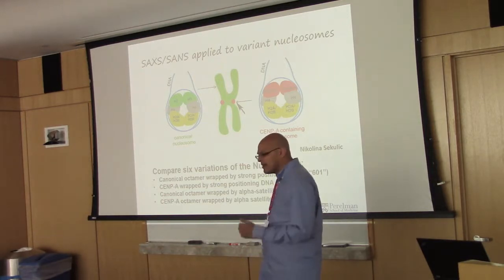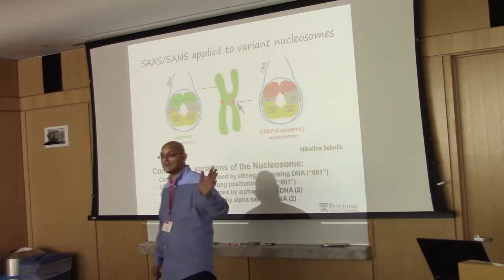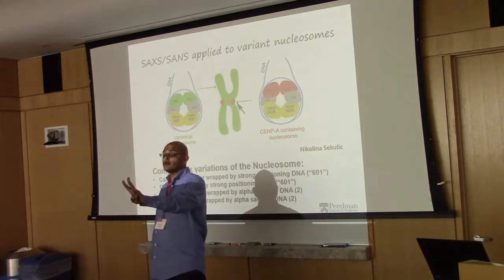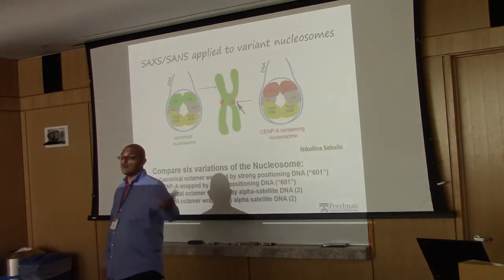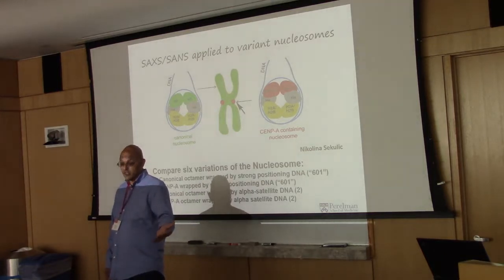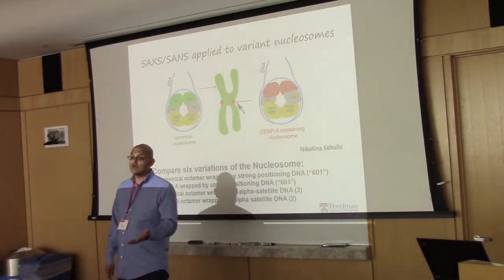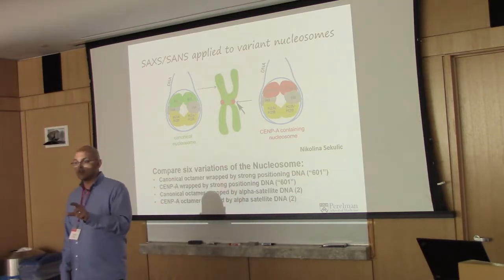What we wanted to do was find out why it is that they were different. If you just take all 80 or so nucleosome structures in the Protein Data Bank and superpose them, we find two fundamental problems. All those nucleosome structures are within an RMSD deviation of 1. They all pack in very similar ways, as if they're in chromatin. And secondly, they're missing a ton of atomic inventory, 30% of the protein inventory of a nucleosome.